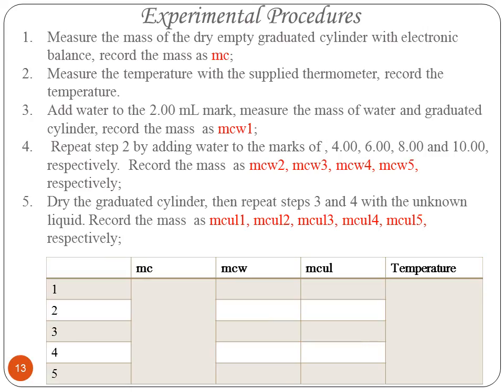Here is a recommended procedure and table to record your data. You only need to take 12 measurements and you will be done. It should not take longer than 15 minutes.